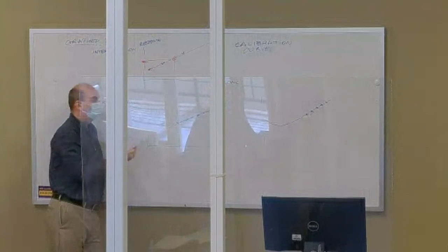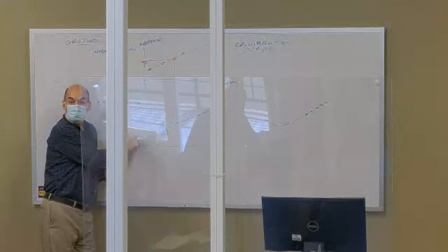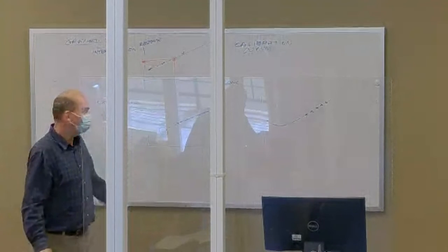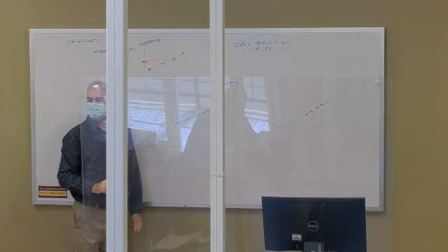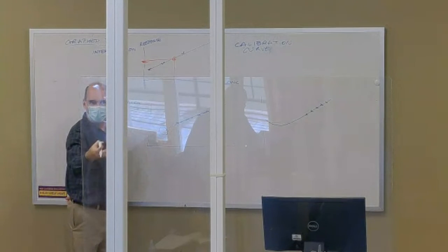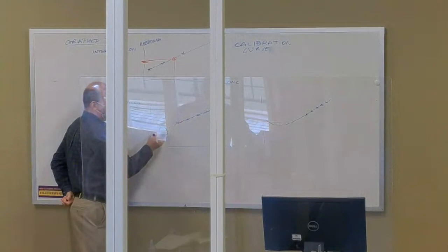If you have uncertainty about your sample because you have to extrapolate the data, here's what you can do. You build the calibration curve after you've taken your first sample. So here's my sample, and I don't feel confident about it. So here's what I'm going to do. This is grape juice, right? I want to measure concentration of grape in grape juice because I don't want to put too much grape in it, and it costs too much. That's my sample right there.